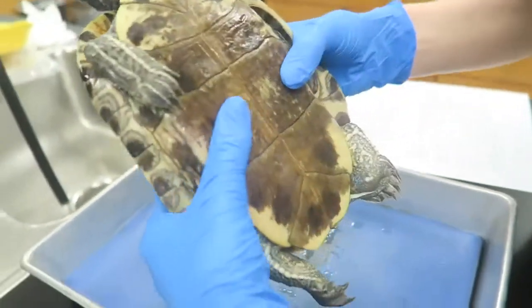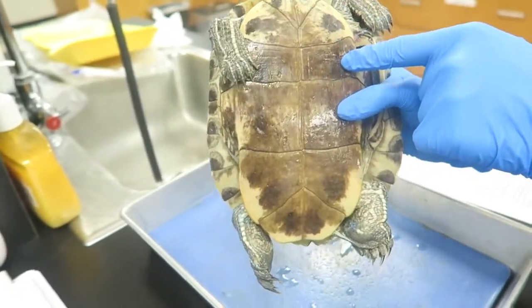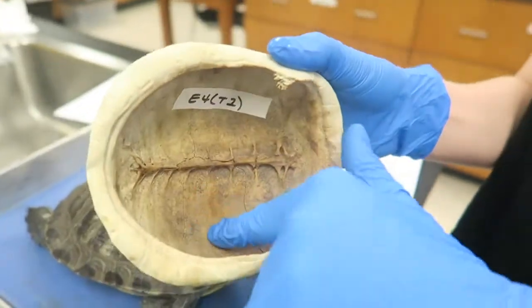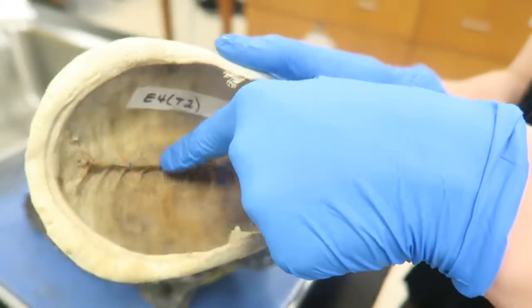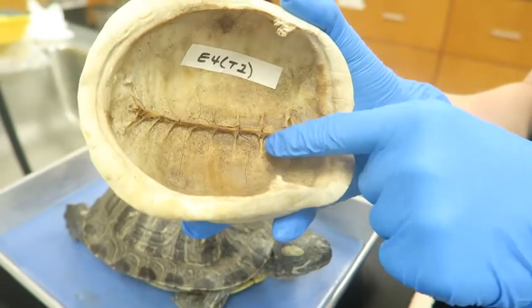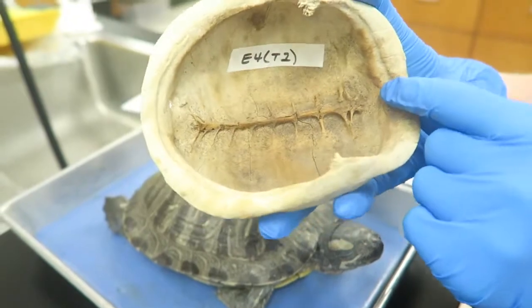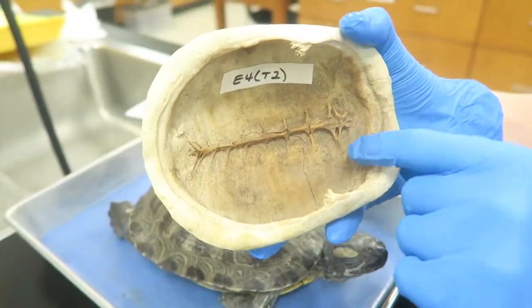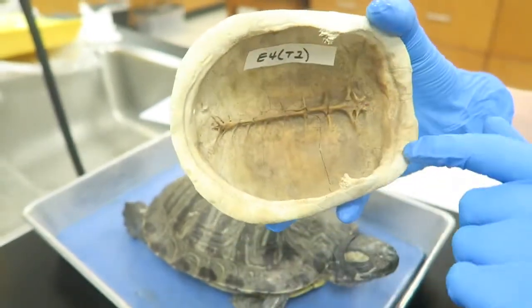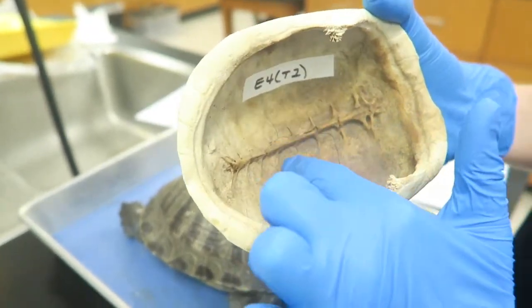On the ventral side there are six different layers of scutes: the gular, humeral, pectoral, abdominal, femoral, and anal scutes. On the inside of the carapace you can see the dermal plate and the vertebra, which forms the spine. The vertebra are fused to the carapace and extend out to form the ribs, making up the axial skeleton. This fusion of the vertebra and the ribs creates support and stability for the carapace. There are also many more plates inside, such as the peripheral plates on the outside, the costal plates, and the neural plates which are under the vertebra.